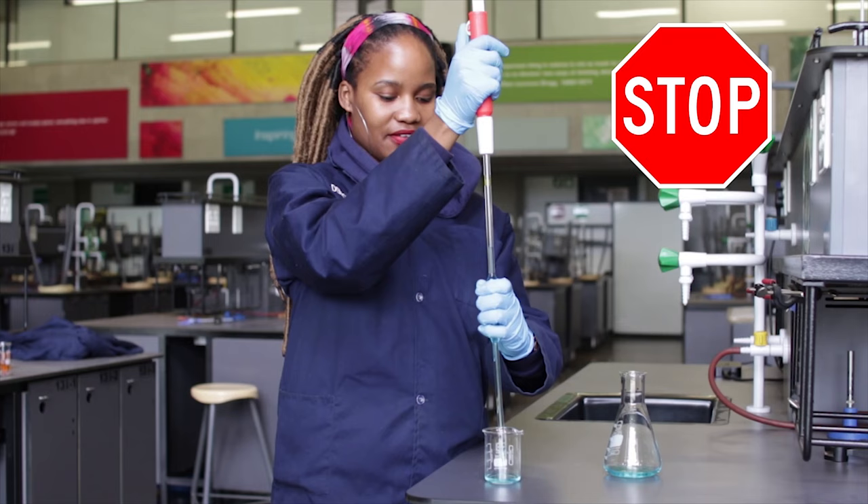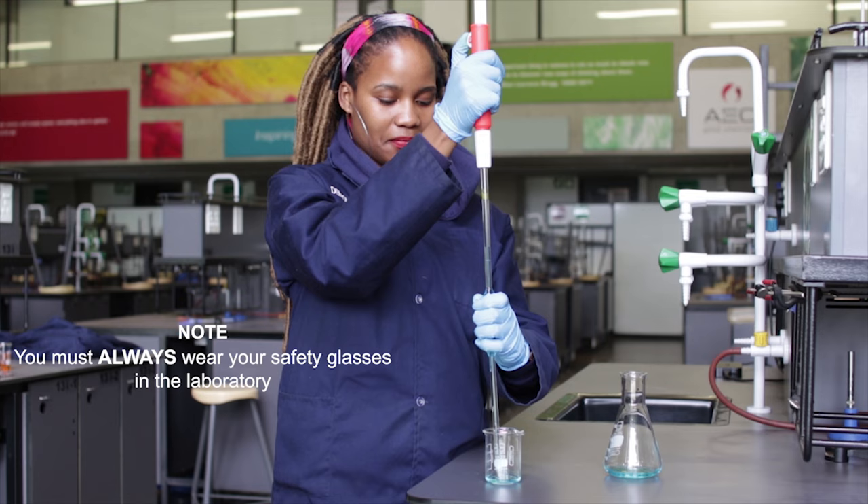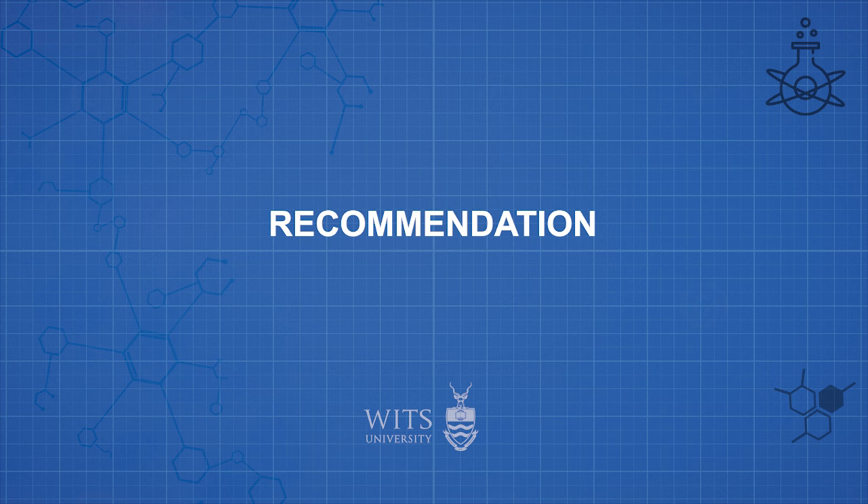Do not touch the bulb of the pipette, as your body temperature will result in heating up the glass of the bulb, which will result in the glass expanding, altering the volume of solution delivered by the pipette.